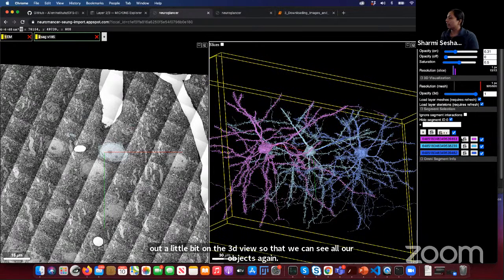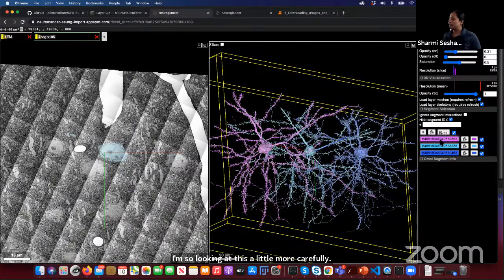So looking at this a little more carefully, the bottom part of this panel lists each of the objects that you have selected. And the colors of these rows correspond to the actual object. The other cool thing is that you can highlight one of these objects, and you notice that the corresponding row here also starts blinking. So you'll easily be able to identify which object that is.